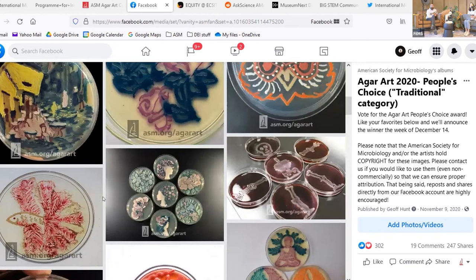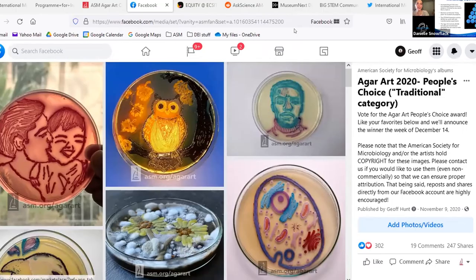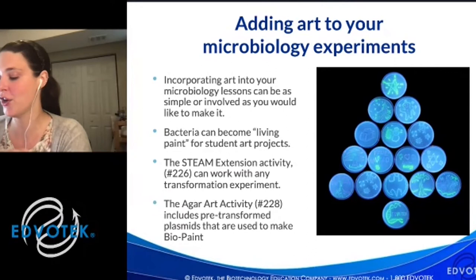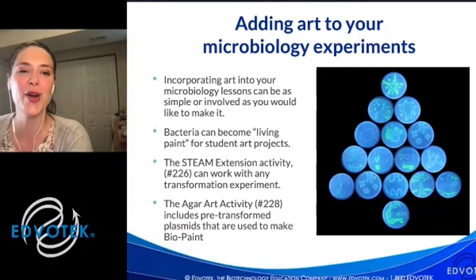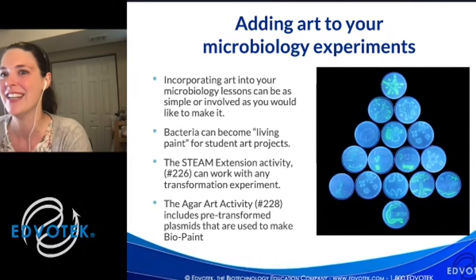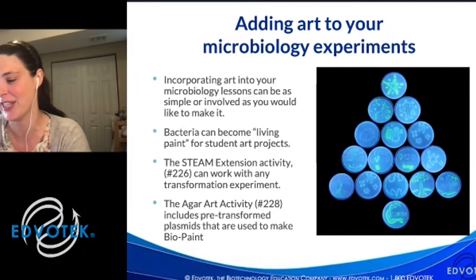But in the same regard, I would say some of the most expressive ones are done with one or two colors. So I think planning on paper and then getting it on the plates is really important. There's one though that you've shown before where it's like a volcano, and that one is fantastic. It looks like there's scaffolding involved and multiple different species of microbe that come together. And I just think it's really neat.